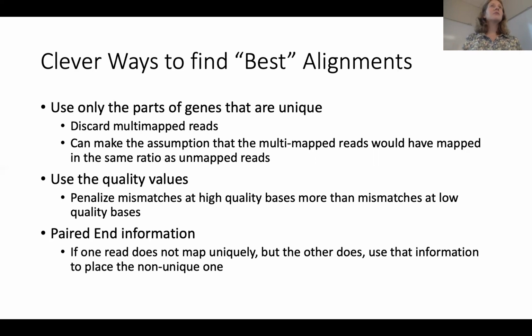Yeah, there are a number of different clustering algorithms that do similar things to that. I could point you to some papers. But yeah, there's many interesting ways to statistically get out of situations where your reads are not uniquely mapped, or other situations. I think I'm thinking more of when you have a transcript reference and you're trying to figure out which transcripts originate from the same gene. You can do some nearest means clustering for that.